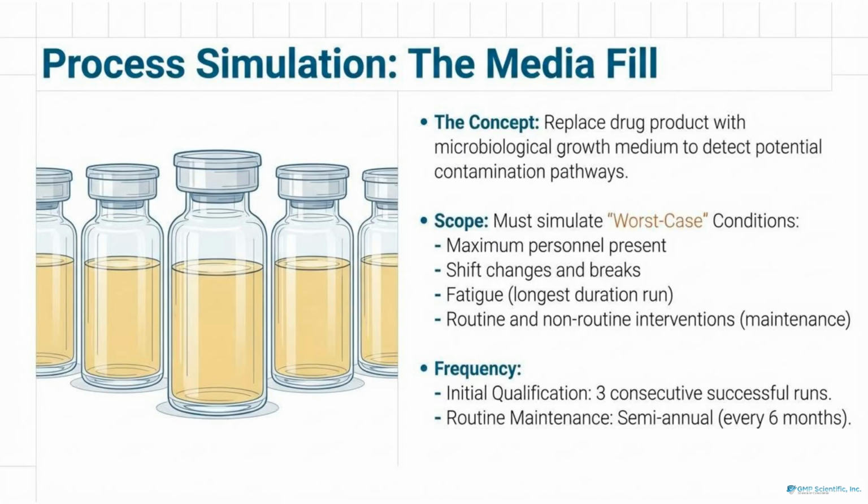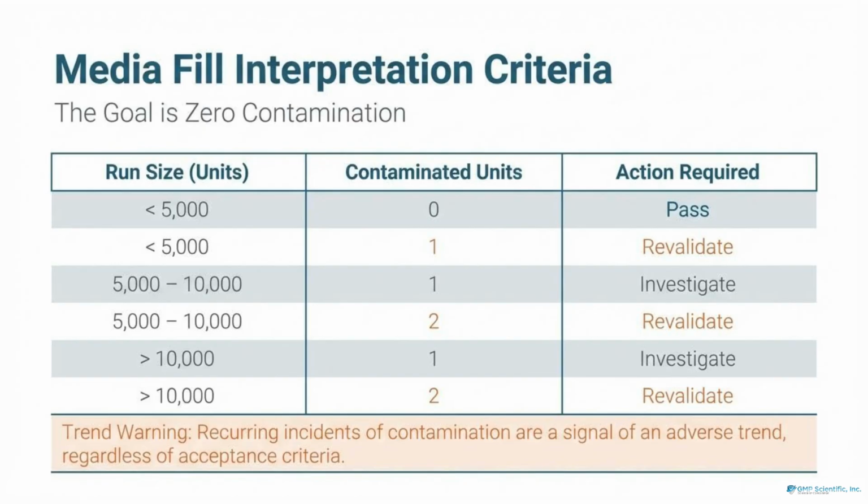To prove our process works, we conduct a media fill. The drug is replaced with a growth medium, simulating worst-case conditions, including maximum personnel and long durations. Initial qualification requires 3 consecutive successful runs, followed by routine maintenance every 6 months. The goal of a media fill is 0 contamination.